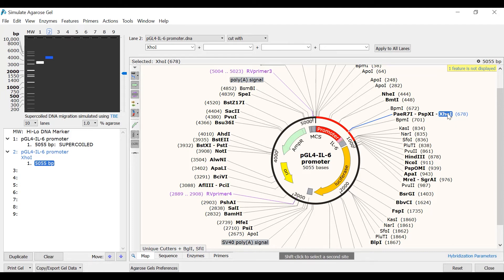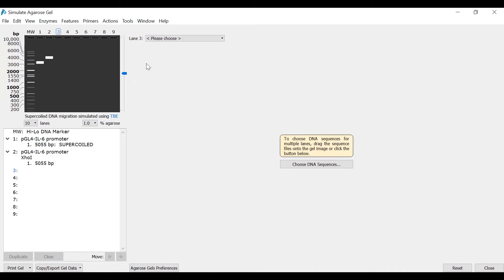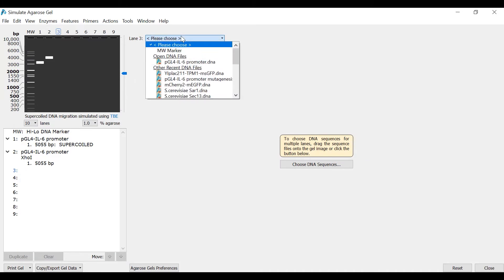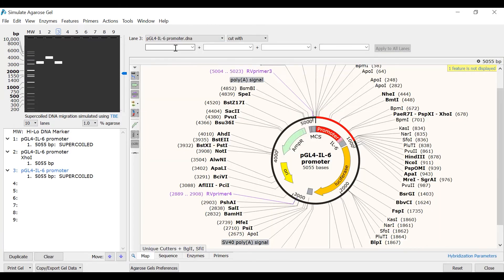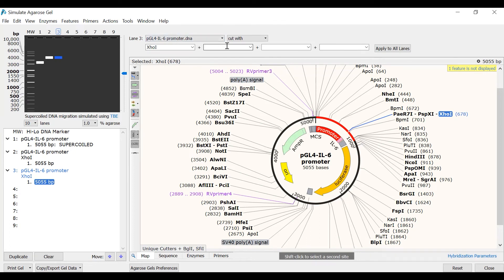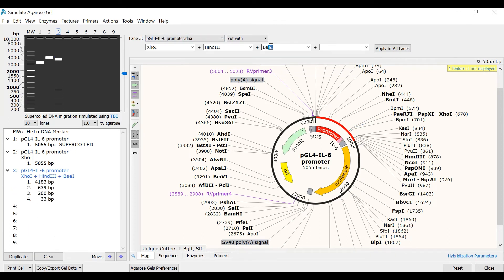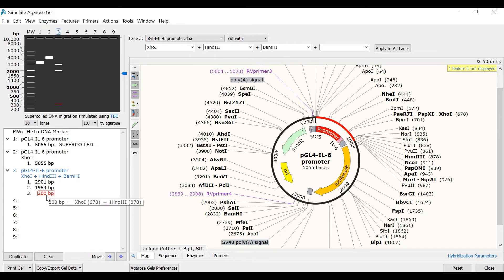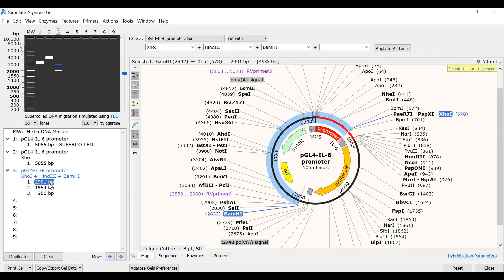Notice how this fragment appears different to that of the supercoiled version. In the next lane, I will again select the pGL4 plasmid, but this time I will cut with 3 enzymes: XHO1, HindIII, and BamHI. I can now see that there are 3 bands in lane 3. If I click on a band in the gel image or in the list view, this fragment will be highlighted on the map view. That's an overview of simulating restriction digests on an agarose gel.